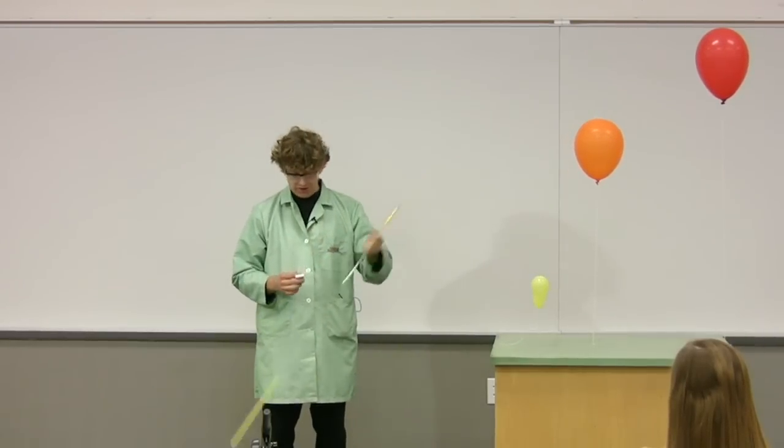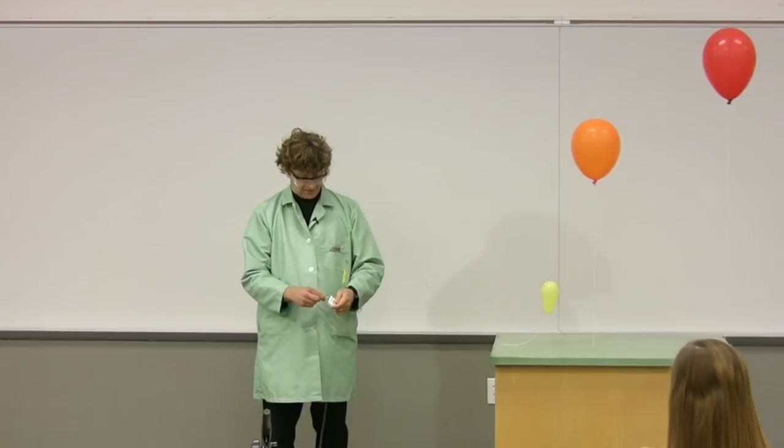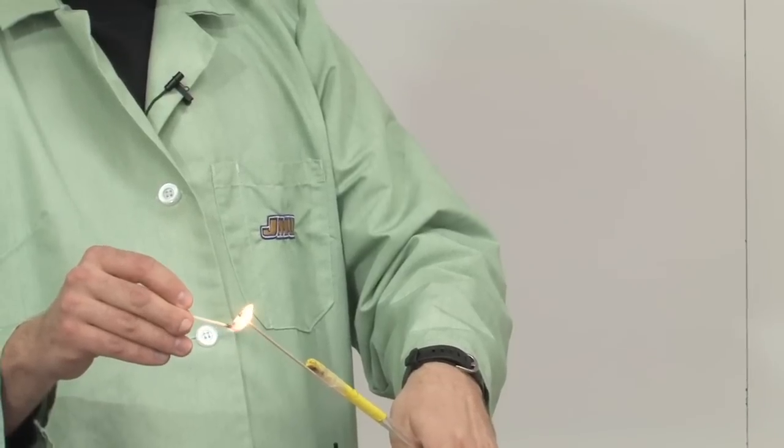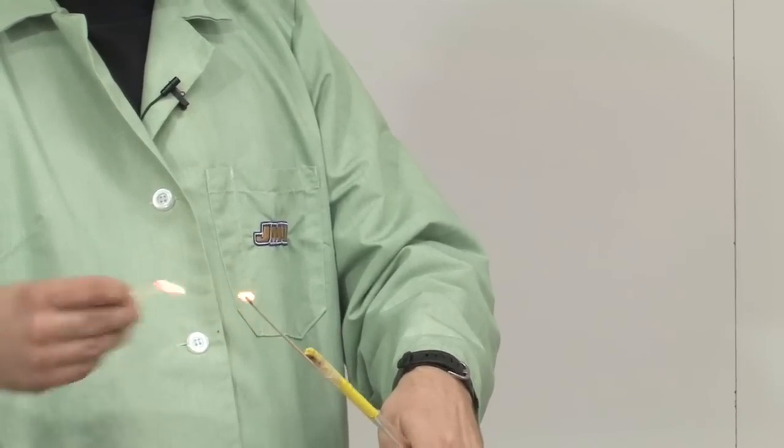So that I can stay a safe distance away, I'm going to light a wooden dowel on the end of this long stick, so I can stand far enough away.